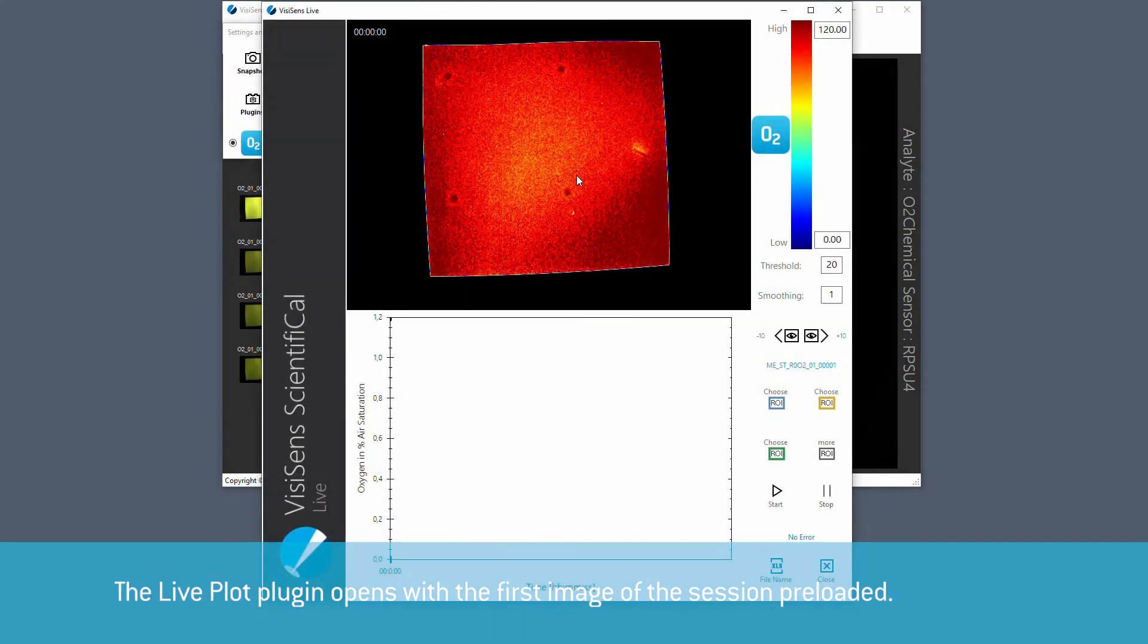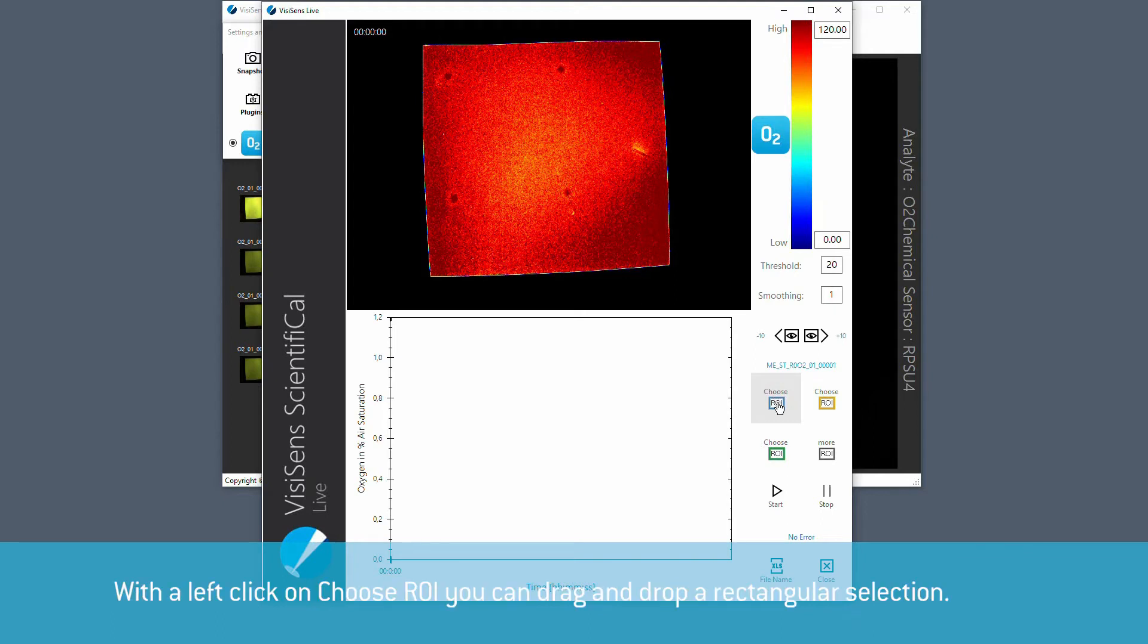The Live Plot plugin opens with the first image of the session preloaded. Now you can choose a region of interest.